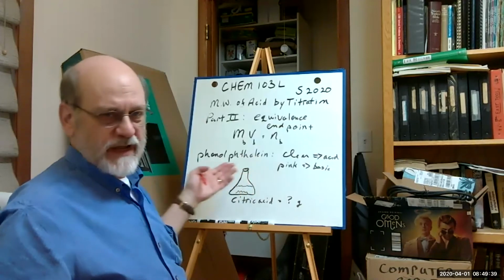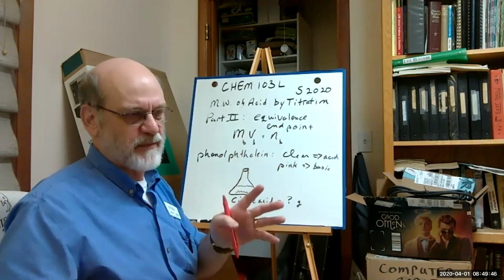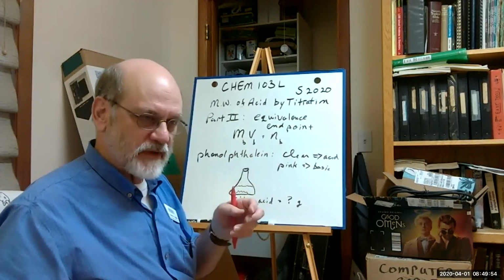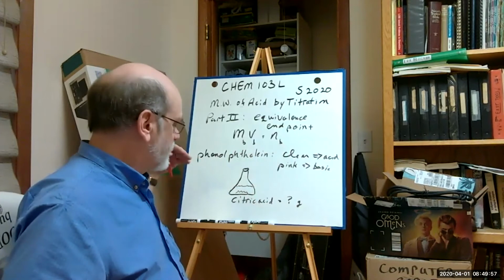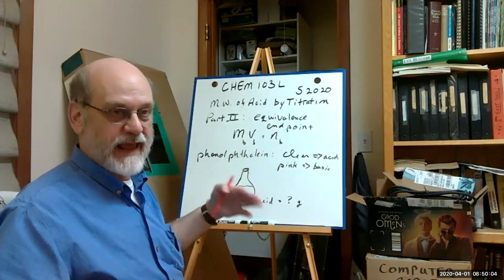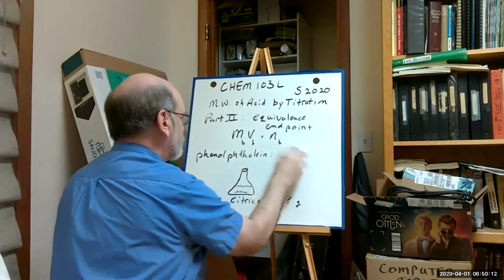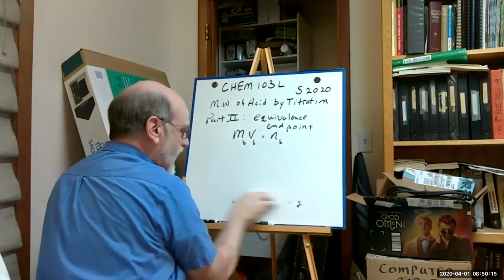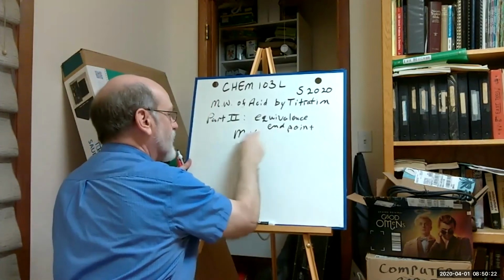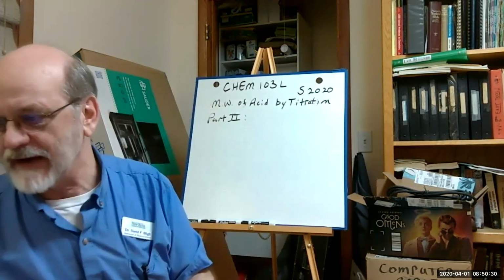But for phenolphthalein, the color change starts at about 8.3 and persists until about 9 or 10 in that range. So the difference in volume that's incurred by using this indicator versus another one is so small that it's a reasonably good indicator for any acid-base reaction that we're going to investigate. All right. So you add volume of base until citric acid is neutralized. All right. So now we know how much base was added. We know the moles of base that were added.